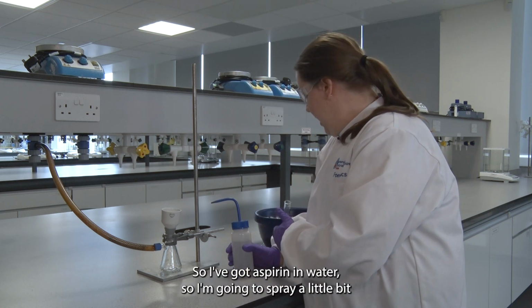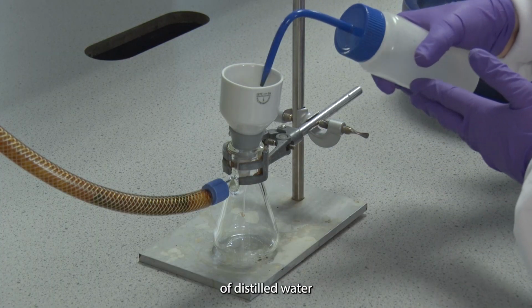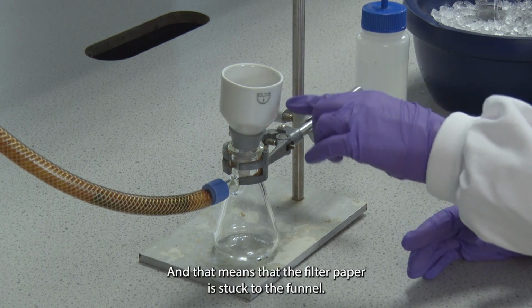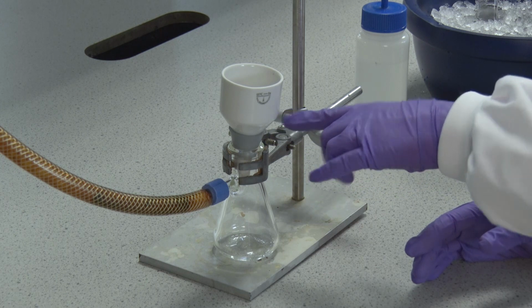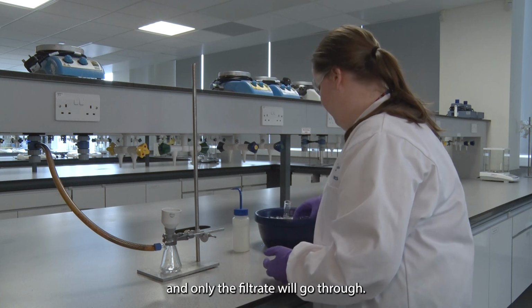So I've got aspirin in water, so I'm going to spray a little bit of distilled water onto the filter paper, and that means that the filter paper is stuck to the funnel, so all of your product will stay at the top and only the filtrate will go through.